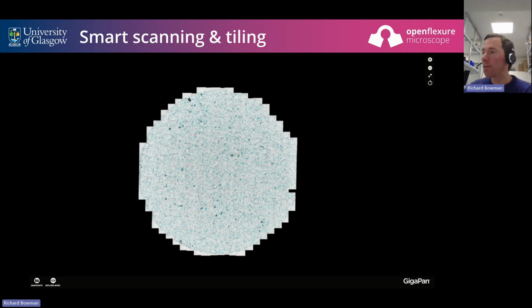But that's the sort of thing that's possible if you have a microscope that is computerized and so able to move itself around, record digital images, and do a bit of processing. I'm going to treat us to that again.